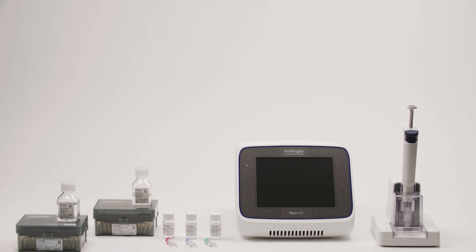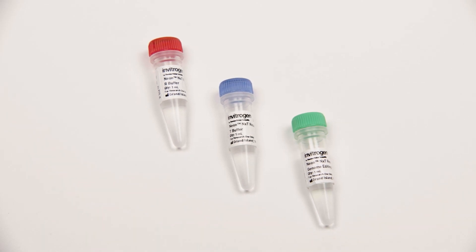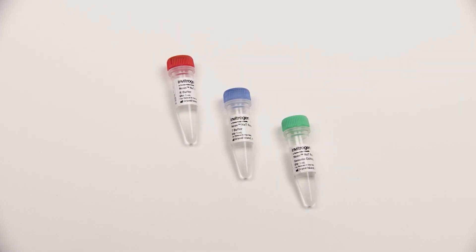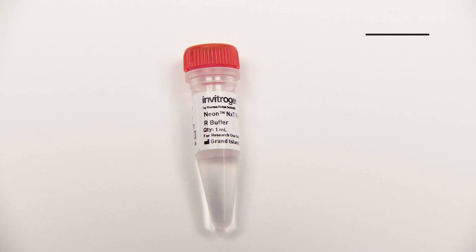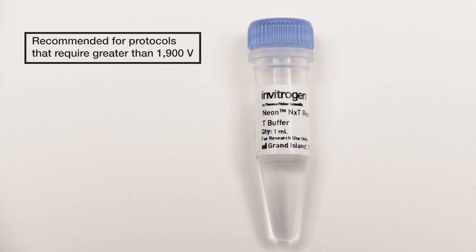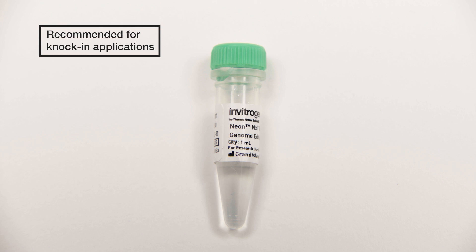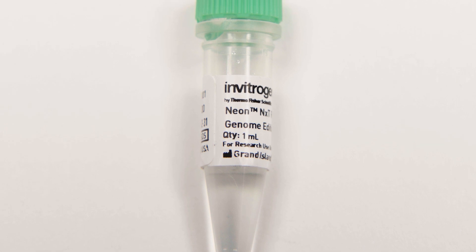So how does transfection work with the NeonNext Electroporation System? The first step is selecting the resuspension buffer appropriate for the voltage protocol you will be using. The buffer kit comprises the NeonNext Resuspension R Buffer, the NeonNext Resuspension T Buffer, and the NeonNext Resuspension Genome Editing Buffer. The NeonNext R Buffer is recommended for protocols less than 1,900 volts. The T Buffer is for protocols using voltage greater than 1,900 volts. The GE Buffer is for knock-in applications and promotes homology-directed repair, and can work with most types of cells.